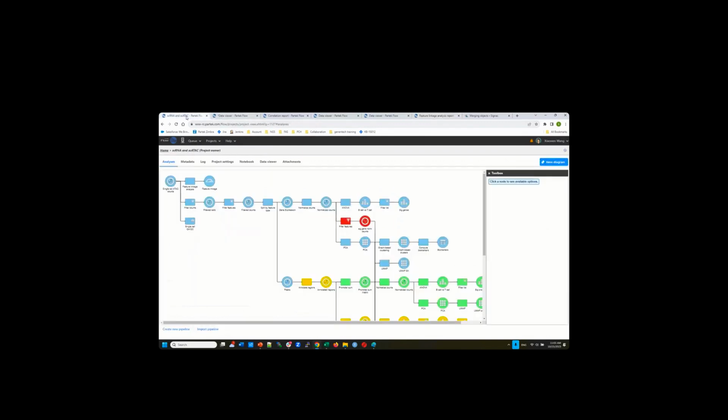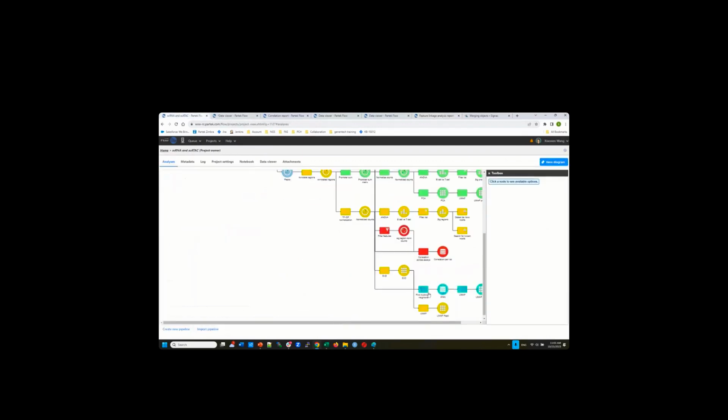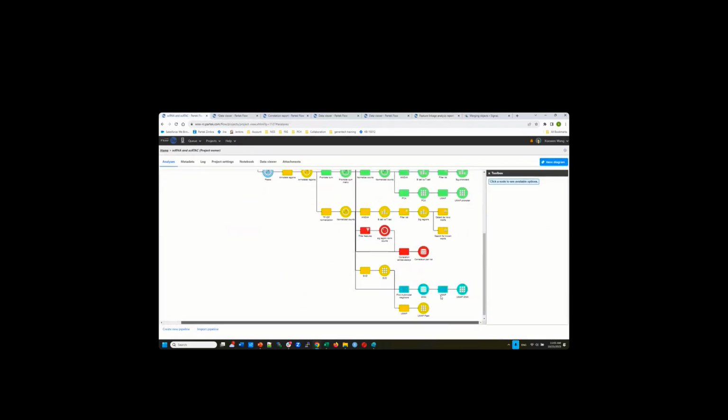So that's another part. Oh, one more thing I forgot to mention: for the ATAC-seq result, of course, you can perform pathway analysis because you have a gene name. You can perform enrichment analysis, and for ATAC specifically, you will do motif detection. This is exactly the same as bulk ATAC-seq analysis.